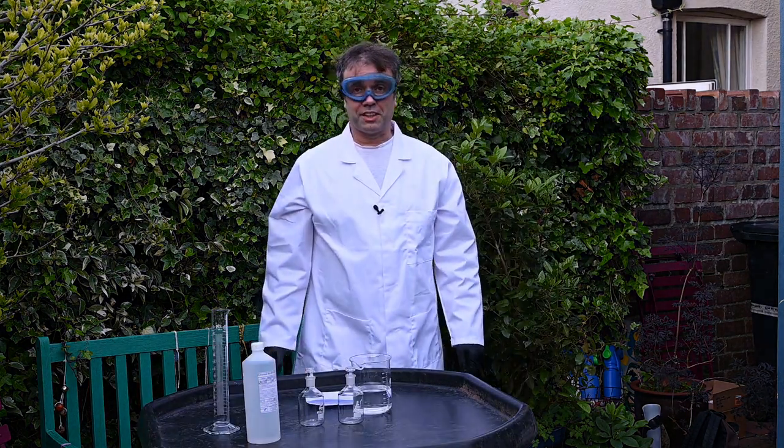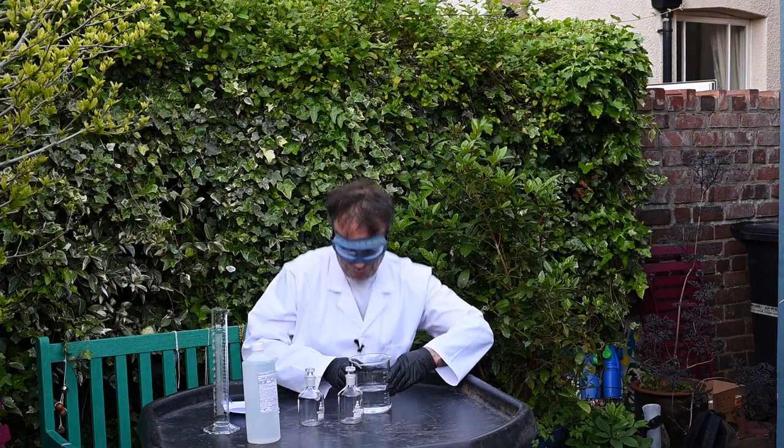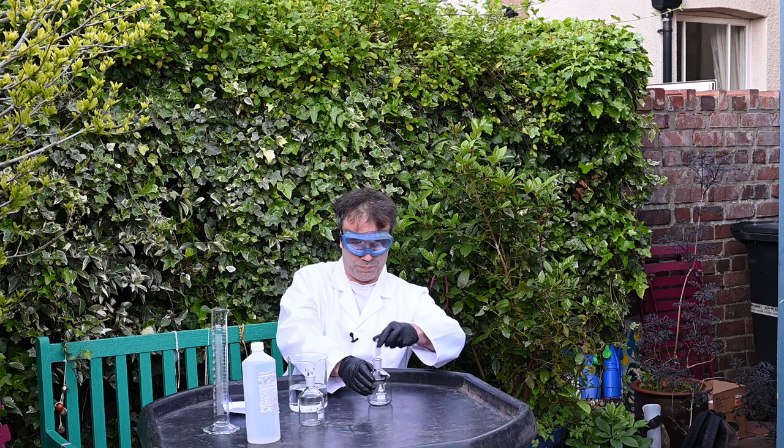Finally, I'm going to try and pour this acid into these bottles. I'm not sure if I should be using a funnel here, but we're going to try without one first.